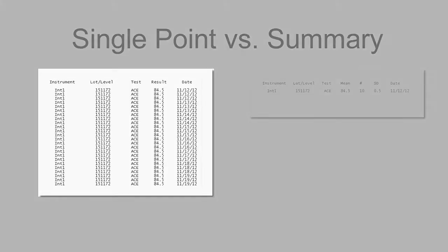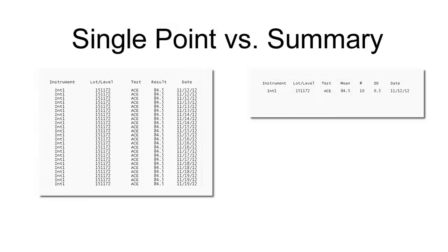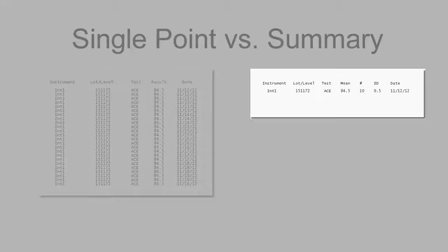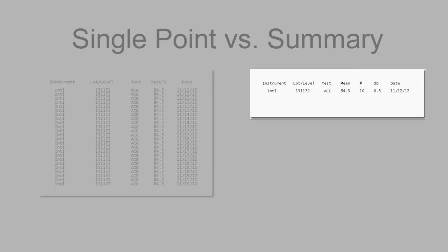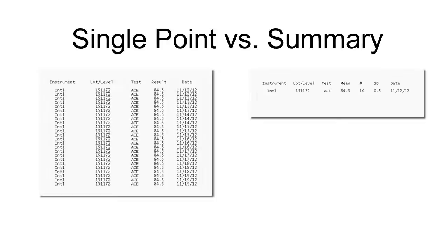Single point requires you to enter individual points for each test. Summary data entry includes a mean, SD, and number of points for each test. Summary data will not be evaluated against any rules nor displayed on the Levy Jennings chart. It is suggested for Unity interlab participation only.